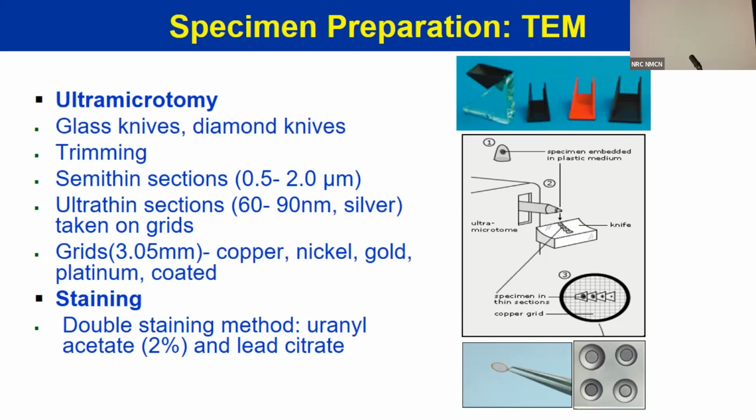For example, if you want to examine a particulate specimen, you can embed it in agar, and then it will be like a tissue, and you can cut it.